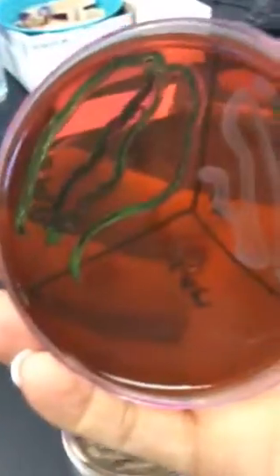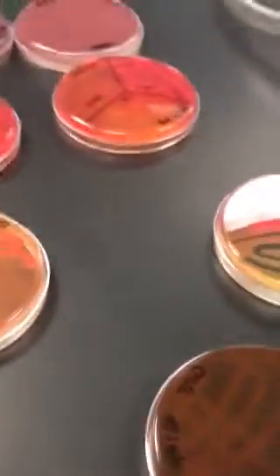So somebody who's got metallic shiny green, please hold it up and open your plate so the other people can see. Does anybody see shiny green? If your unknown looks metallic shiny green, like your E. coli on your tri-plate, you probably have E. coli as your unknown. Does that make sense to anybody?